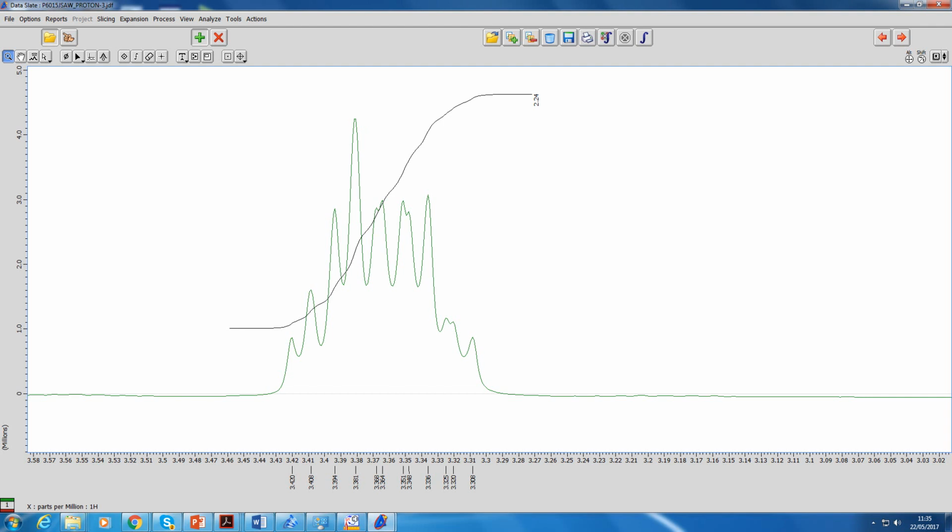And in that bottom left box, there's a delta X, so I can get it exactly where above it should be overlaying in X, where there should be no chemical shift. So delta X is 0, there. So at least I've only Y shifted it, I haven't X shifted it. There might be a reason for X shifting, but in this case I just want to hover above. Maybe I don't want to do it so high, I can just bring it down a bit. To something like that. That's quite nice.